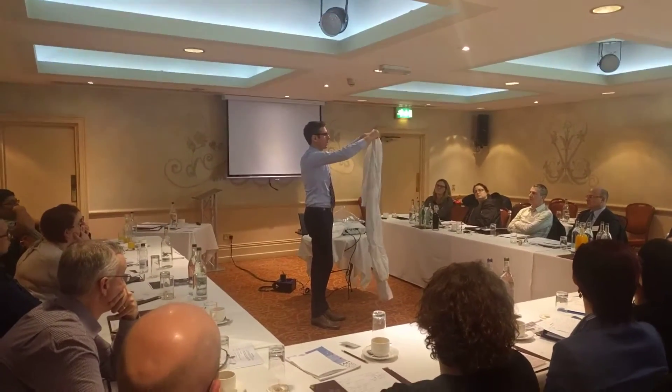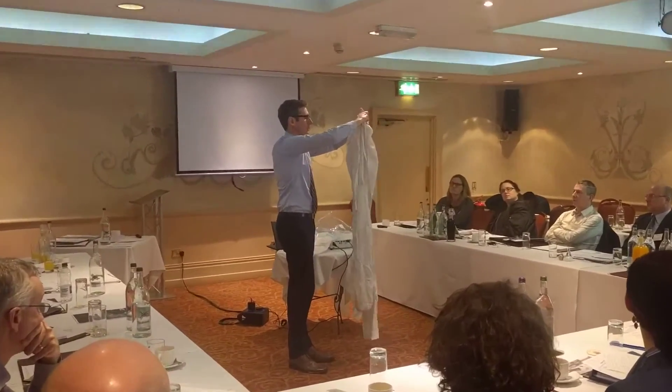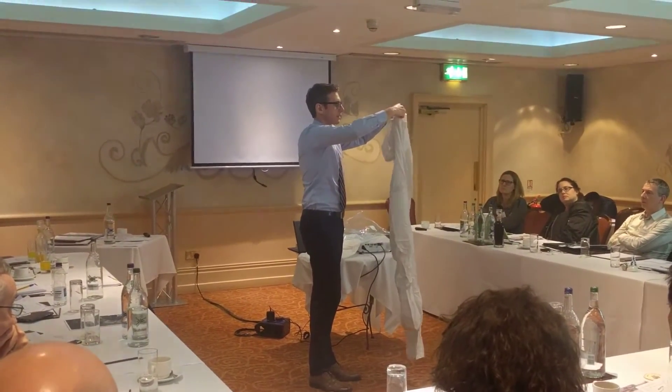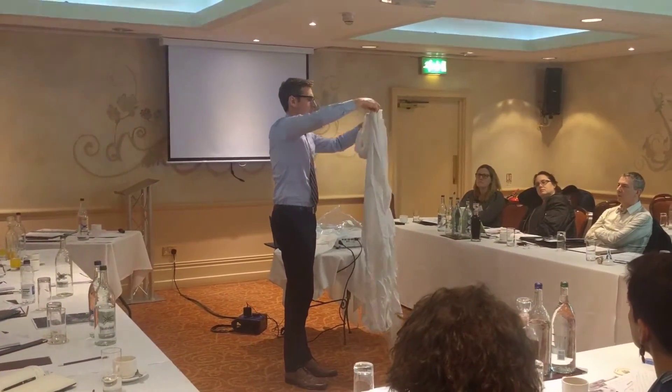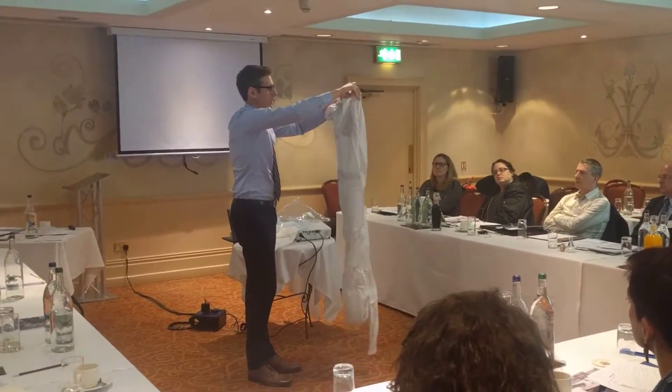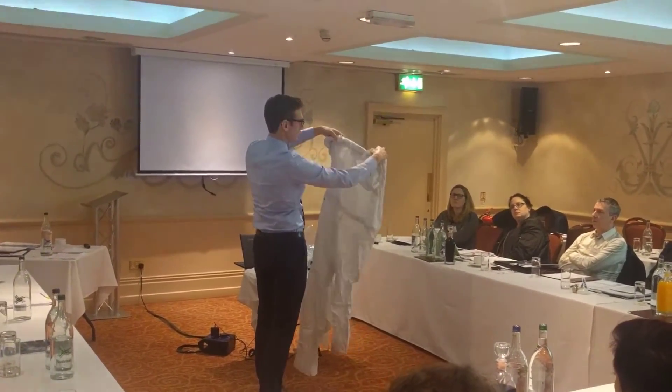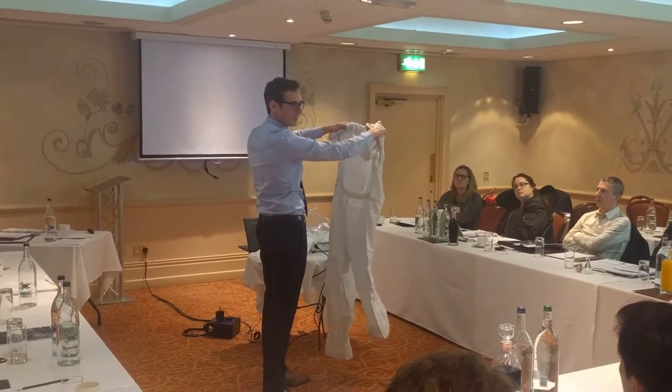I'm putting the first arm to the collar and continue rolling. Same with the second sleeve. I need sterile gloves for that technique because indirectly I'm touching the outside of the overall.